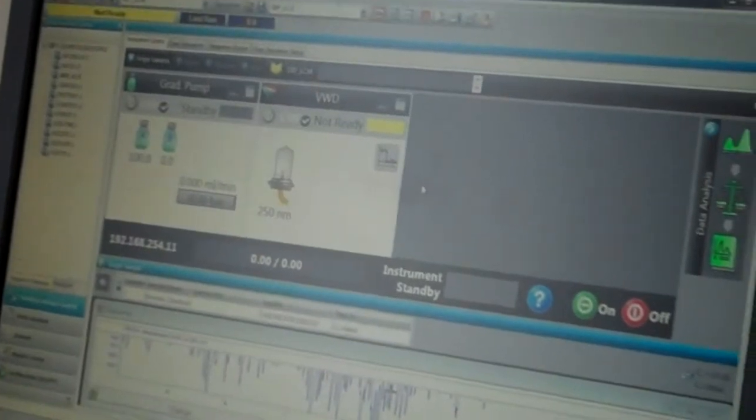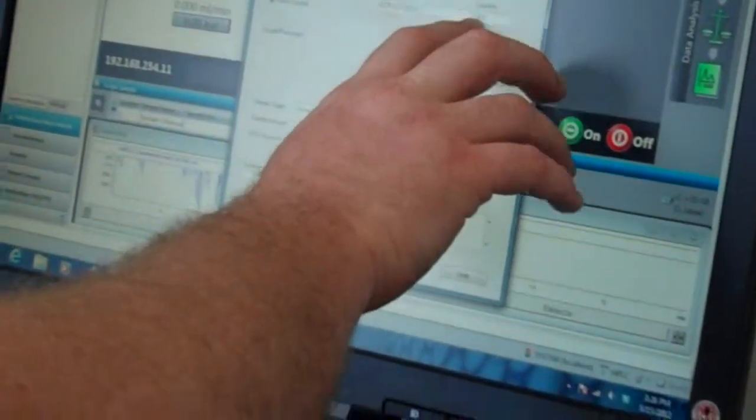And if your sample has a number, like if it's sample number 3021, I would put an underscore after that. Otherwise, you can't tell what it says anymore because it's all jumbled. So you put an underscore, and then this is the counter.